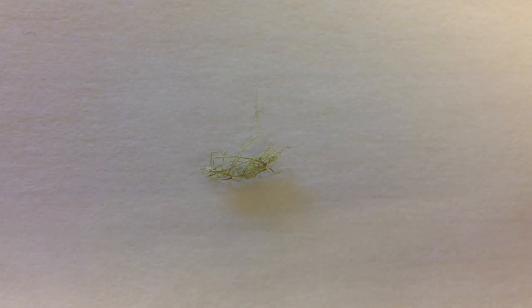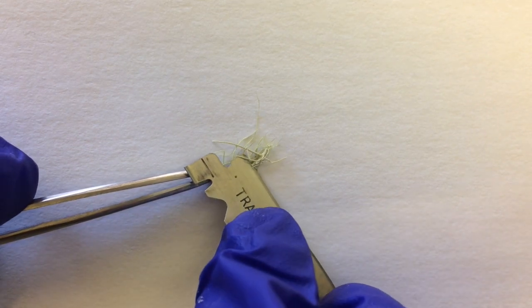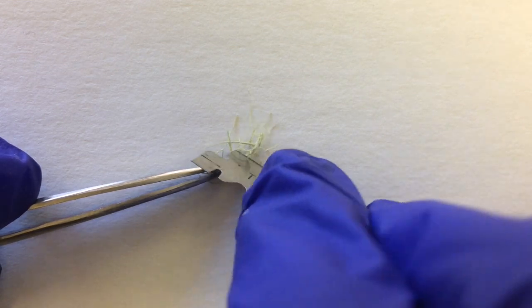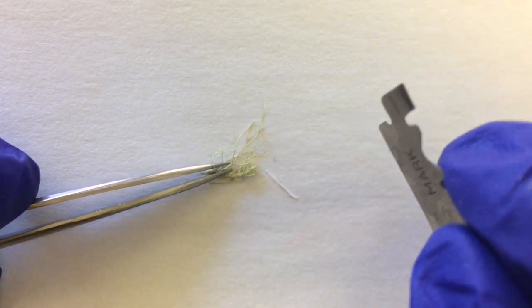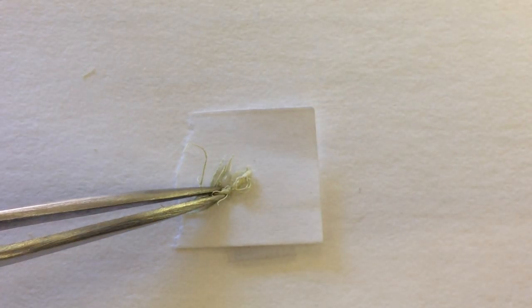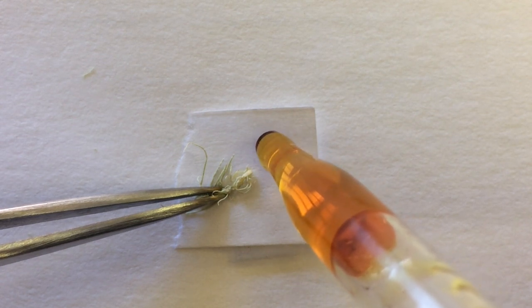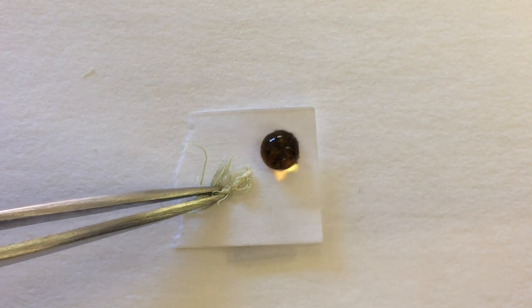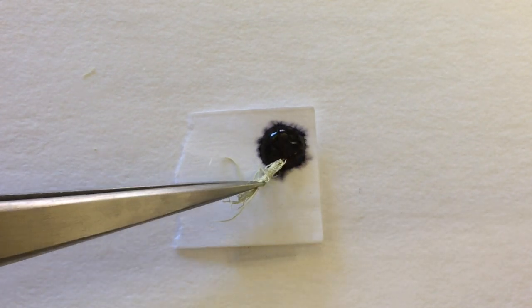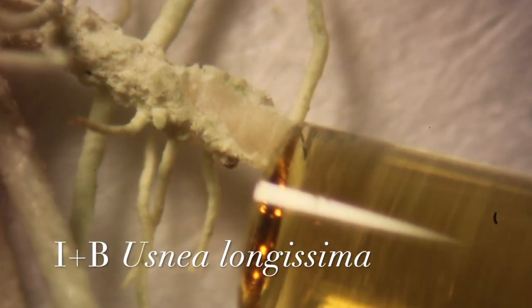The first reaction we will look at is the I test. The first step of any spot test is to expose the tissue that you want to be testing. In this case, we want to expose the medulla. Next, we will drop a small amount of the IKI solution onto a piece of scrap paper or onto a microscope slide. You can see the IKI reacting with the starches in the paper as it turns bluish black. Let's see how the reaction looks up close.